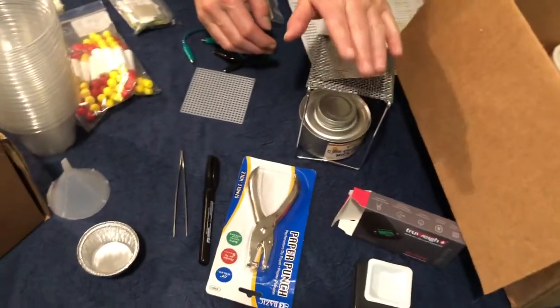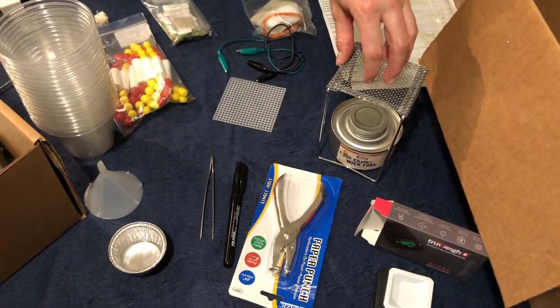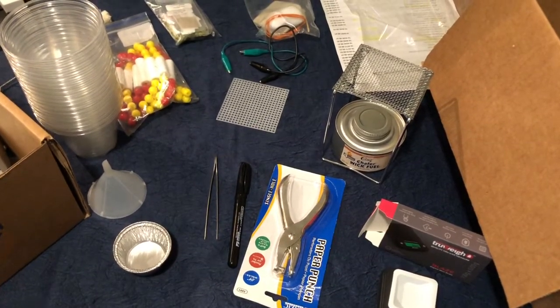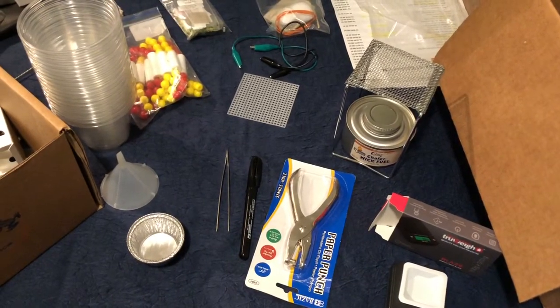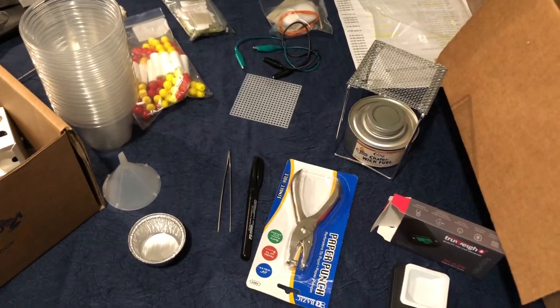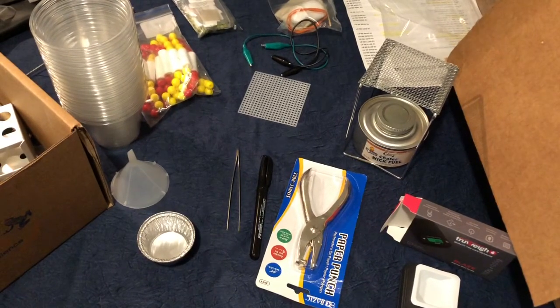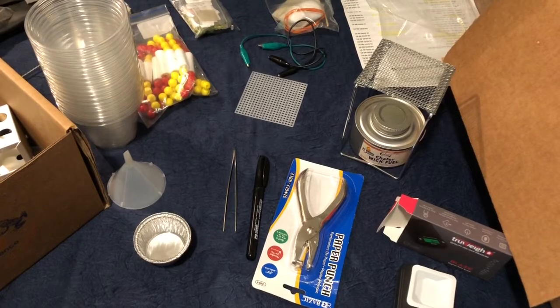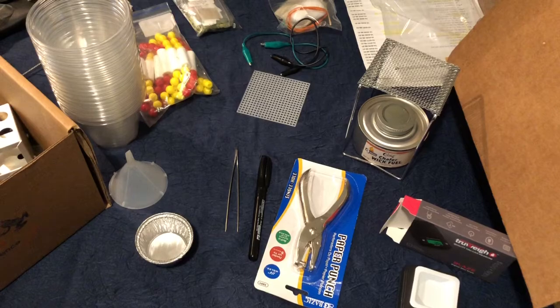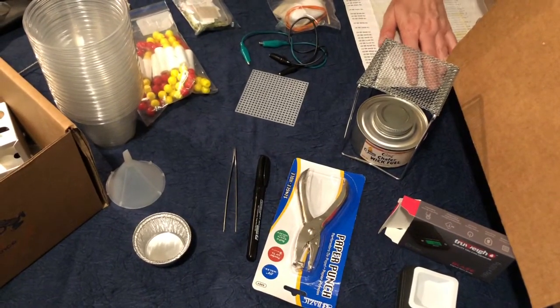Back here is our heat source and our stand. They have given us more fuel than what is actually required for the experiments — that's intentional. If you make a mistake you want to have extra fuel so you can redo an experiment. Sometimes the kit includes a little bit of extra substances, so don't panic. Always keep everything until you are confident the experiment went well and successfully — you may need to redo it. Keep everything until the absolute end of the class.